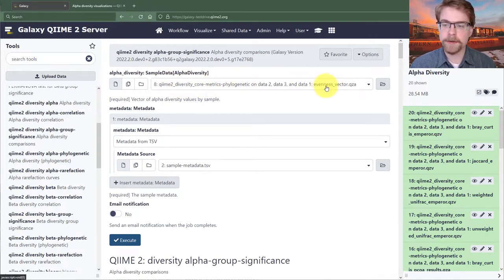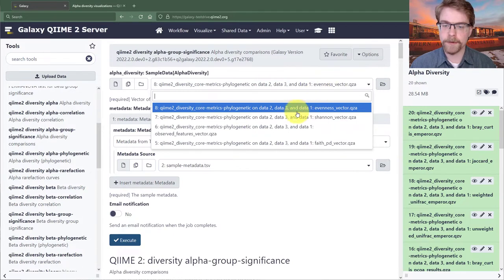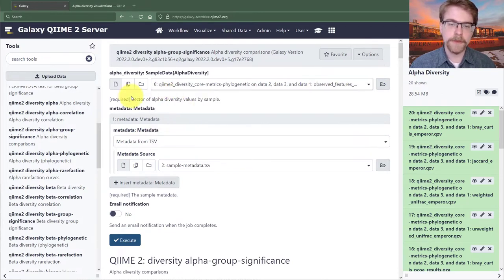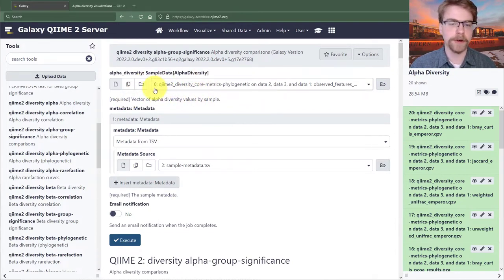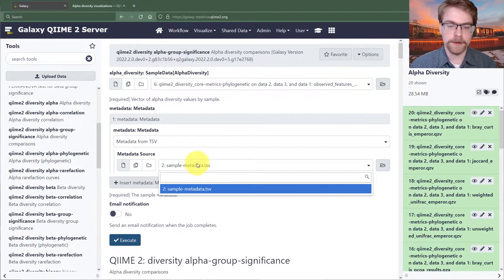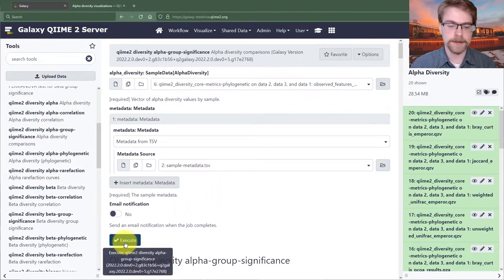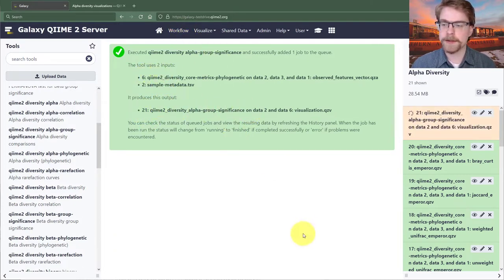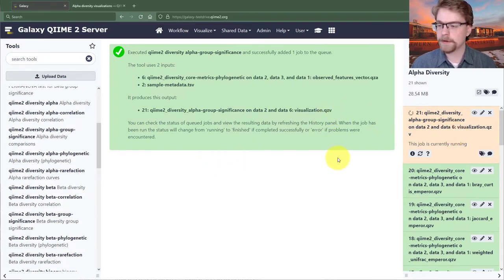We can see it has auto-populated something, but it's not what we want — it's the evenness factor. What we actually want is the observed features vector. My numbers will be different since I've bootstrapped this history to make the tutorial work. We set our sample metadata and hit execute.